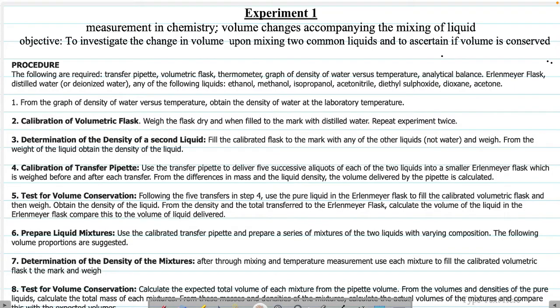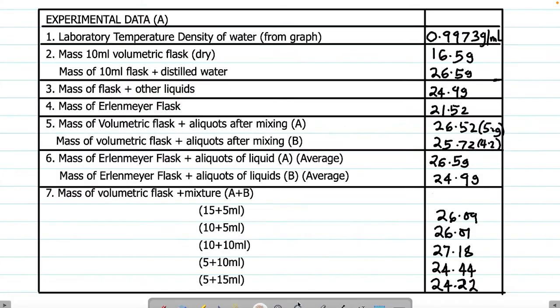So the value they gave last year is 0.9973 grams per ml. Now I've actually carried out the practical, so I'm going to be inserting the videos with this screen recorder, so that it makes more sense for us.